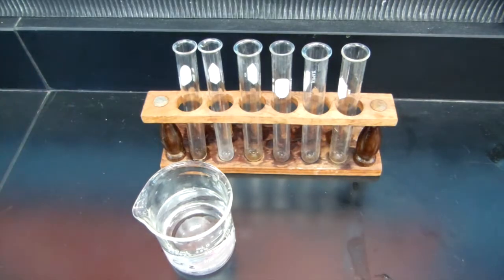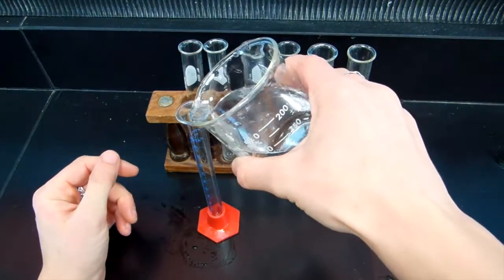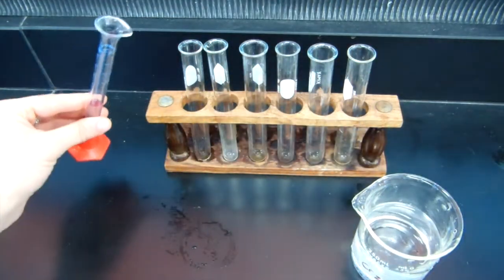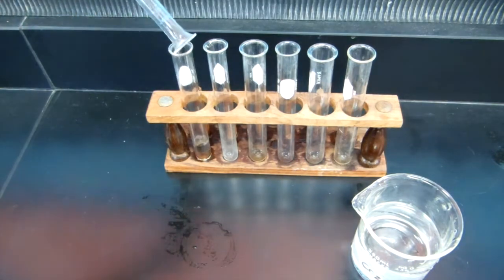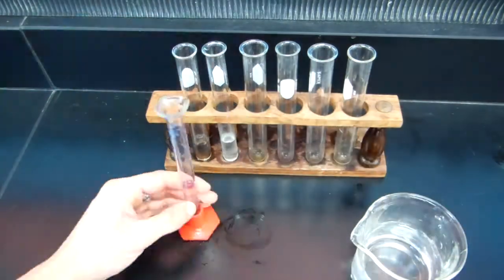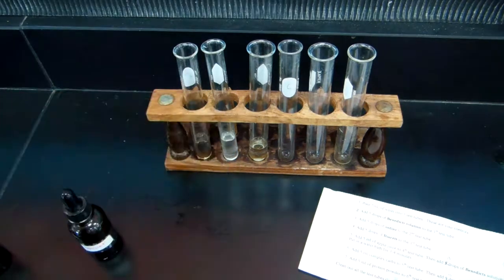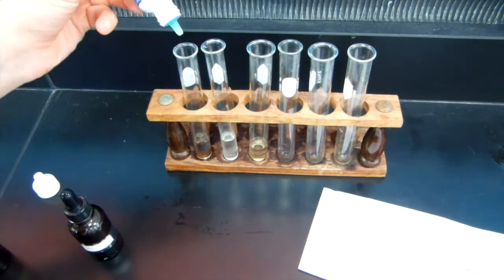It says to measure out 5 mils of water and put them in the first 3 test tubes. So that is water for test tube 1. So for the 3 controls, we're going to go ahead and put 10 drops of the Benedict solution into the first one. And then you'll record the color on that chart.